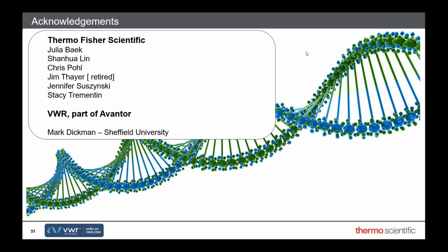Next question: do you have columns for morpholino oligonucleotide analysis? Again, we've done quite a lot of these. You've got so many modifications. When I originally started doing oligonucleotide separations, I thought, well, that's easy, it's 4 bases in a line, can't go wrong. The number of modifications you've got is phenomenal. Most of them, there's a way of doing it. Sometimes you can separate them by ion exchange or by UV. But when you've got mass spec after the DNAPac RP, you can usually see a mass difference. So even if you can't separate, you've got the power of the mass spec behind you. So I'd say, yes, go for it.